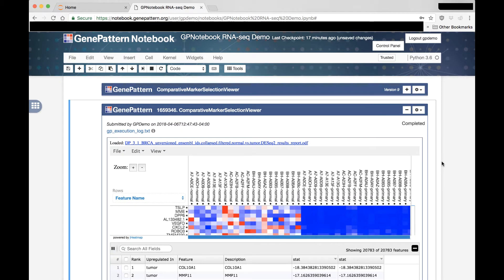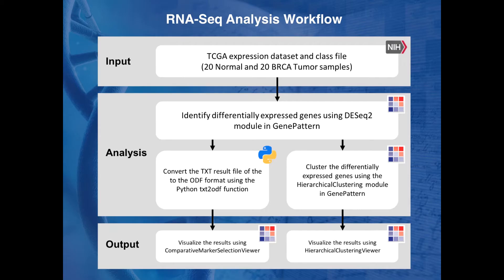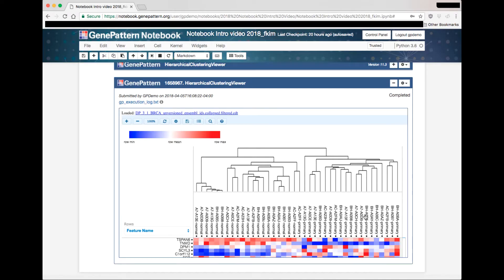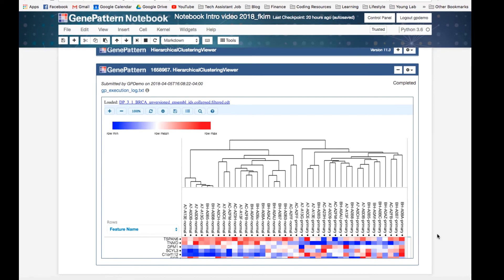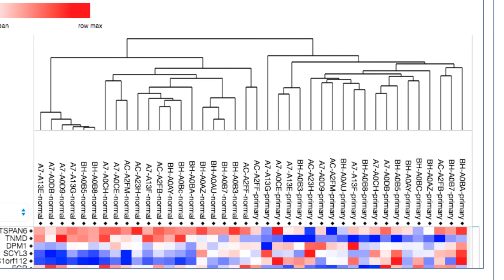Furthermore, in the same notebook, we can use the GenePattern Hierarchical Clustering and Hierarchical Clustering Viewer modules to validate the expected separation of primary tumors and normals into two distinct clusters. We can see that Hierarchical Clustering has clustered all of the samples as expected.